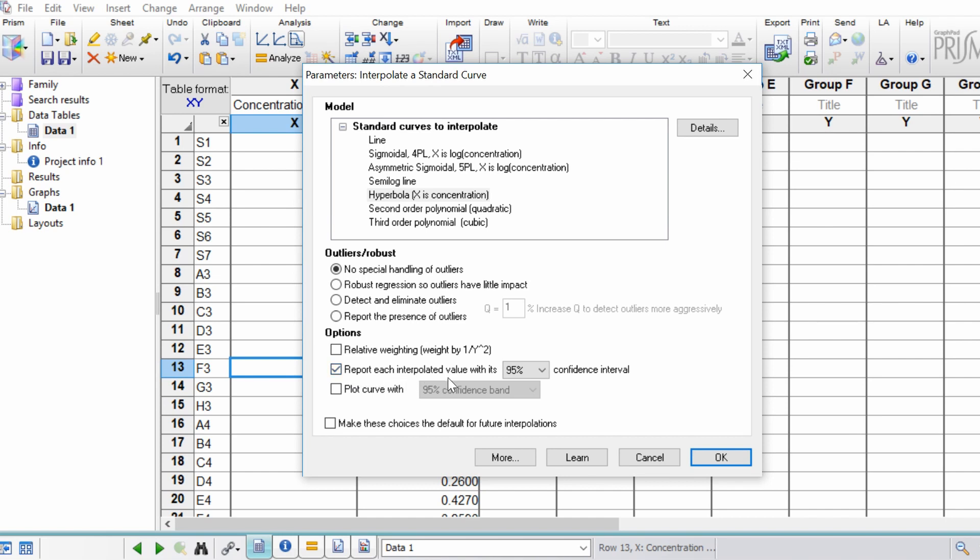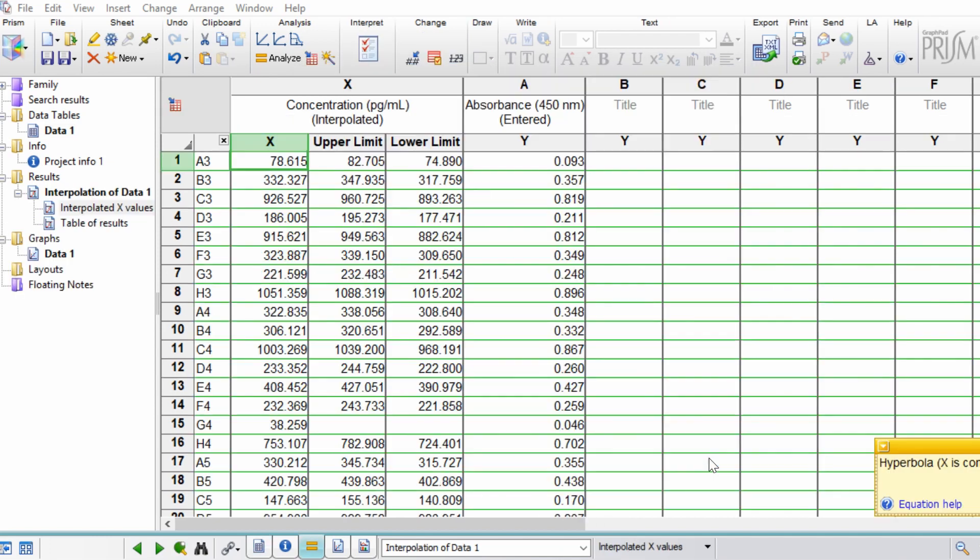And you'll notice there's now a new results sheet that has been opened. What we're looking at here are our different samples and the X values are the concentrations that were calculated by GraphPad by interpolating that standard curve.